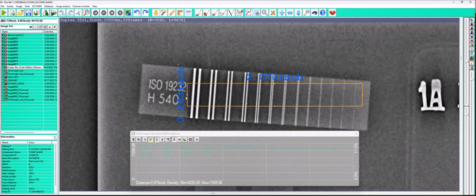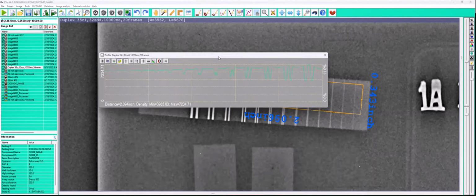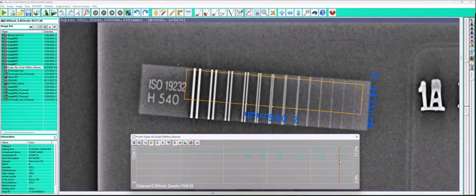grab one side, straighten it up, and then make sure it's 60%. As long as it's more, it's fine. When we do the automatic tool, it's going to take the whole duplex. And then what I'm doing is I'm just going over each one of these.